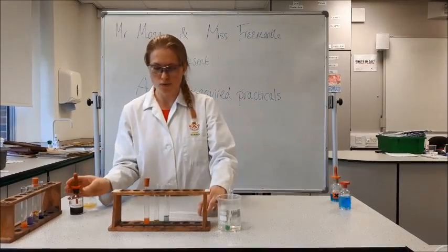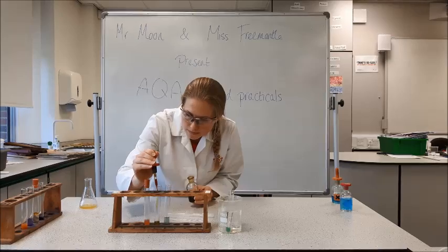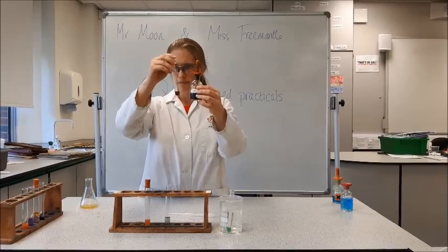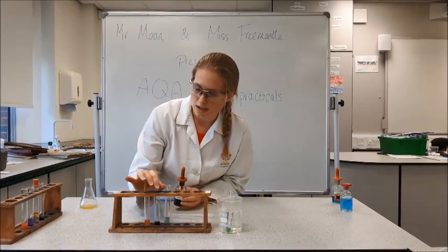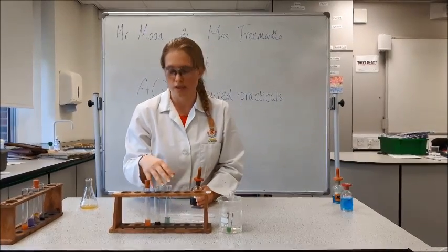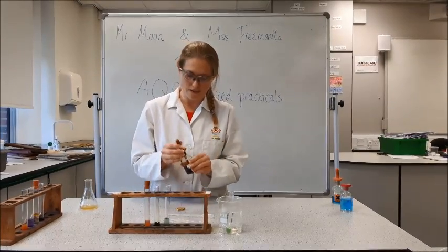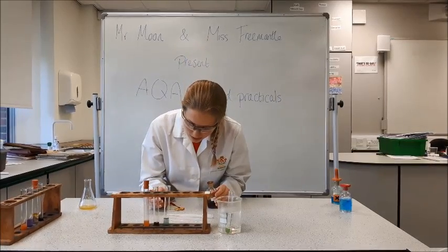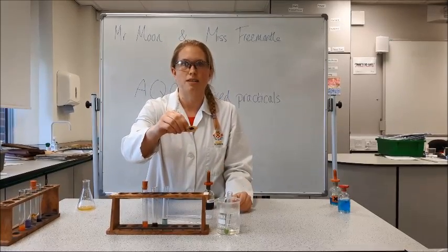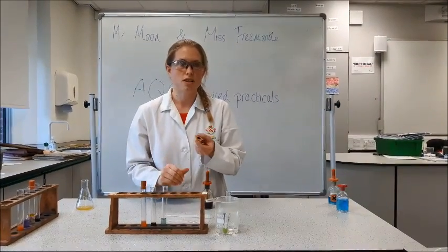Our final test is for starch, so I'm going to add a few drops of the iodine solution. It seems that it hasn't really worked — this could be because not enough starch has dissolved into the solution, or there isn't a high enough concentration for us to see a significant colour change. So what I'm going to do is put some iodine directly on the biscuit, just to prove that the biscuit does actually have starch in it.